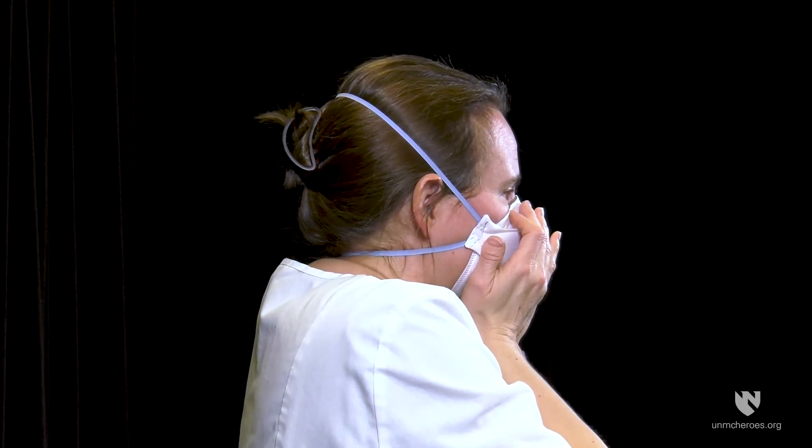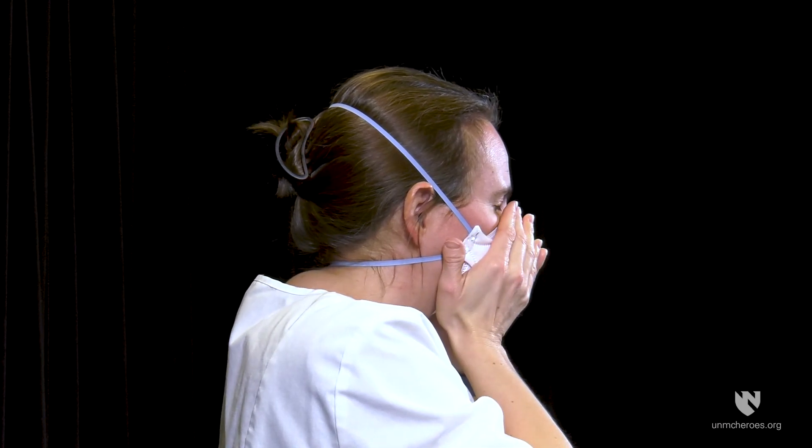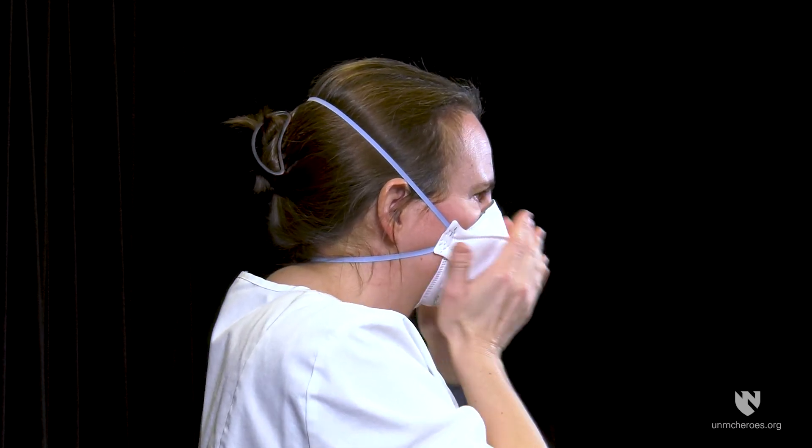Perform user seal check. Place one or both hands completely over the middle panel, inhale and exhale sharply. Be careful not to disturb the position of the respirator.